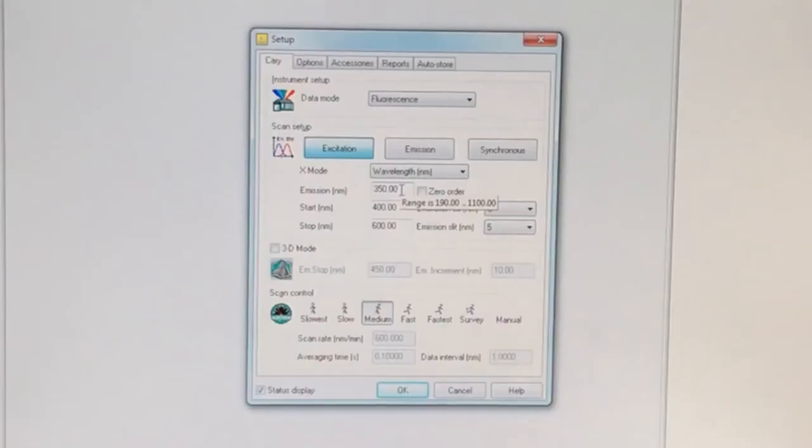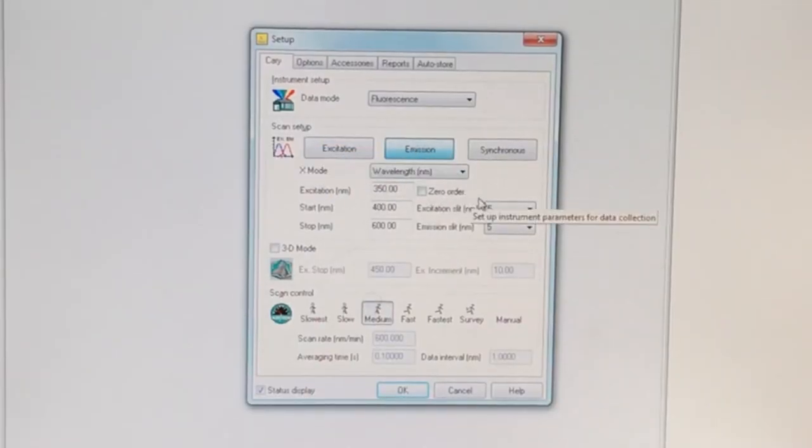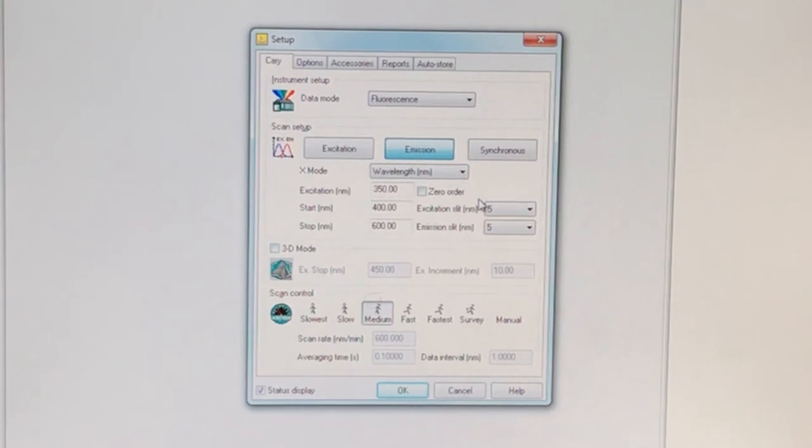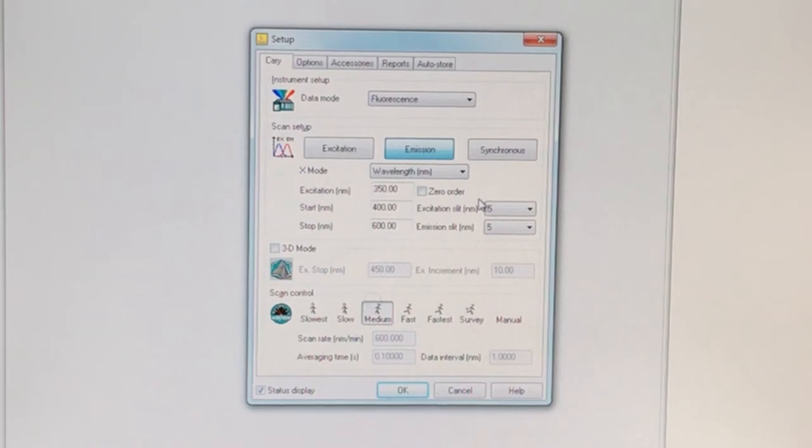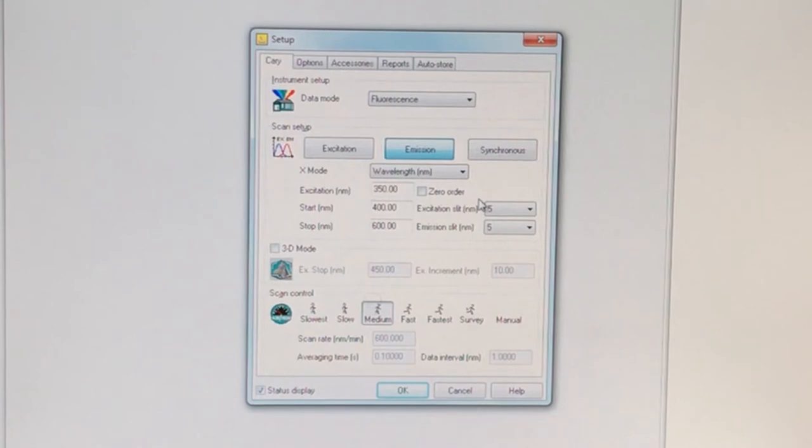So you can change the, let's look at an emission scan. This is the typical thing we're looking at. If you're running a fluorescence emission, you often have already collected the absorption spectrum. So you have an idea of what wavelength to use to excite the sample somewhere where the sample absorbs strongly.